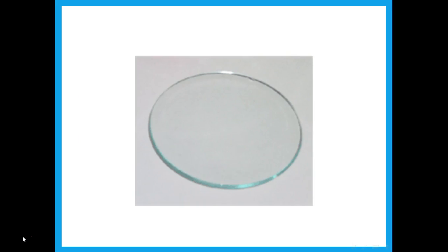What's this? It looks like a glass container. Some people mistake it for lenses that you study in physics, but this is not actually a lens. This is called a watch glass. It's just a piece of glass that we use just as a container for solids, for example.